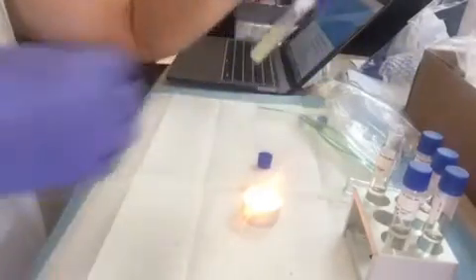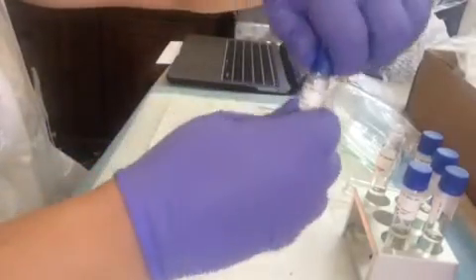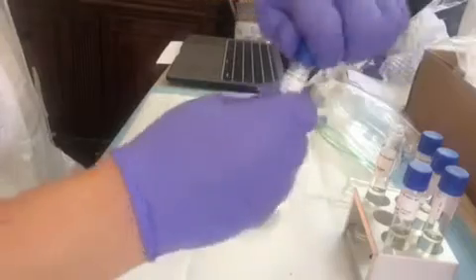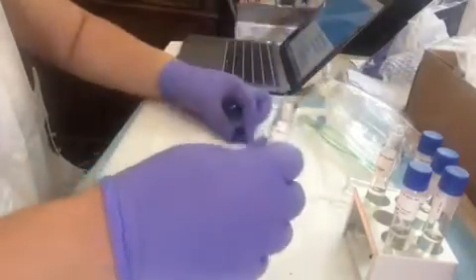Now we have the S. cerevisiae. That's the one we're doing it on. I flame this through the lip as well.